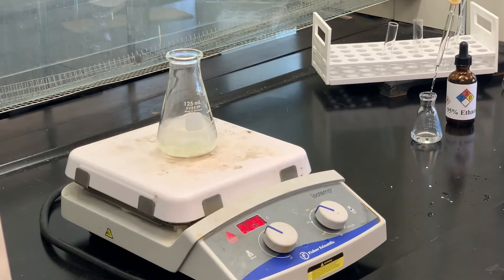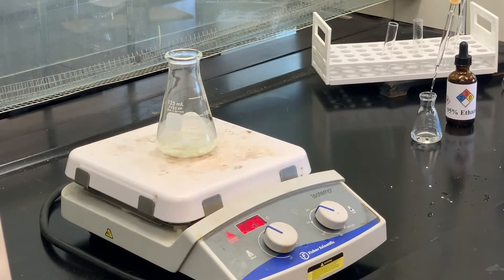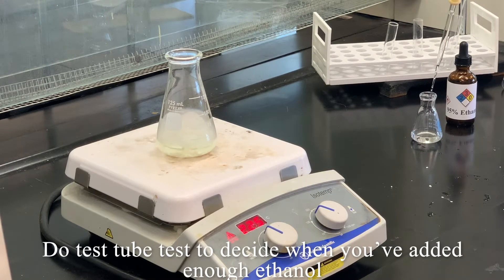So I added some ethanol, and what we're going to do is very similar to our first recrystallization. I'm going to heat that up and not add any more ethanol until everything dissolves. If not all of it dissolves, I'll continue to add just enough ethanol until everything dissolves. Then I'll do that test tube test we use for recrystallization, and if it seems like it's time to set it off the hot plate, then I will.